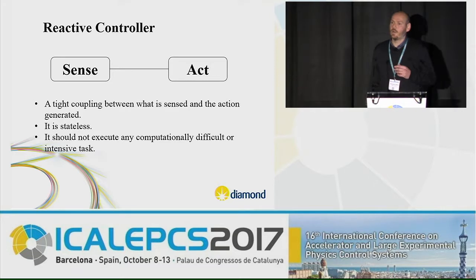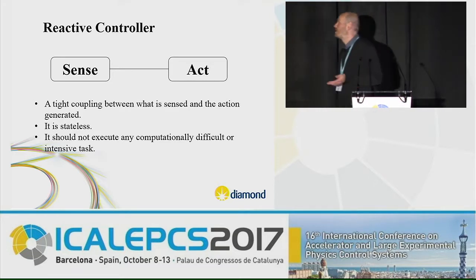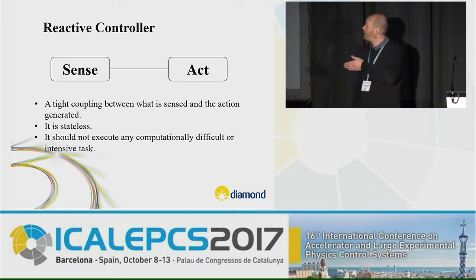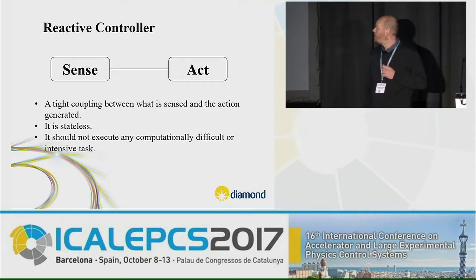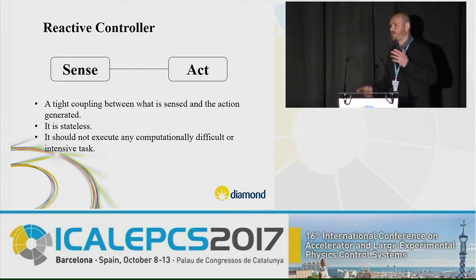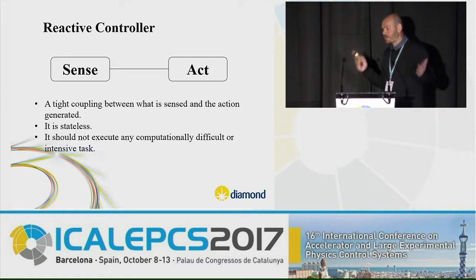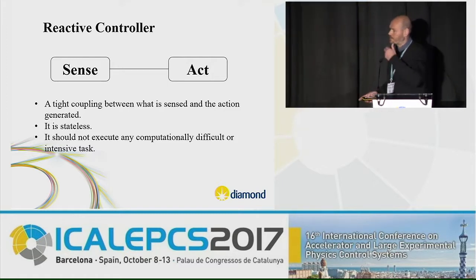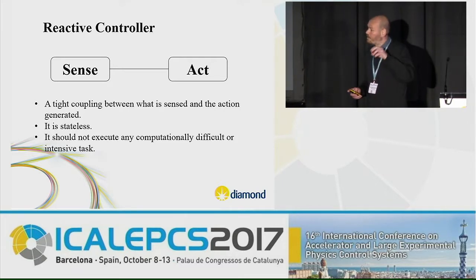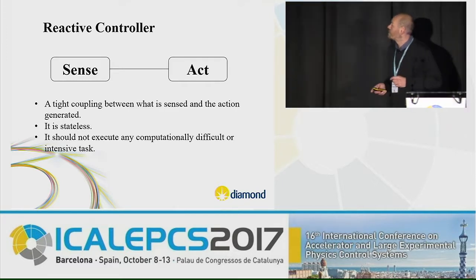This is a well-known architectural model, which is just a reactive controller. Basically, we perform a direct action from what we sense within an environment. These are the attributes of this type of model as well. The most important is that it's stateless, which means if there's a problem, or say we have a catastrophic failure, it doesn't care, it holds no state. If we bring it back up again, it should behave exactly as it did before, purely based on sensing the current state, and it performs the action based on that.